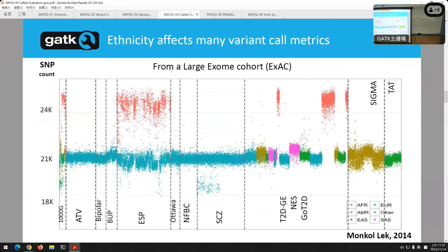And specifically mentioning the Exome Aggregation Consortium a little bit, I think that's what it stands for, they took together a lot of different independent projects and broke them down by ancestry. Someone asked me yesterday in joint calling how you can tell your data is fine when you potentially mix different people together. I mentioned that you can do analysis later. You can separate by likely ancestry and compute statistics based upon that.